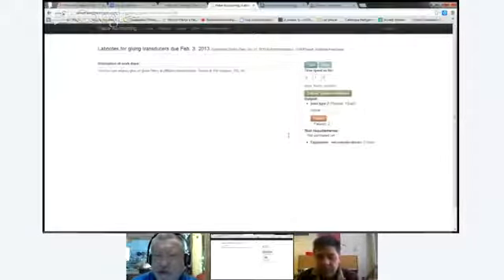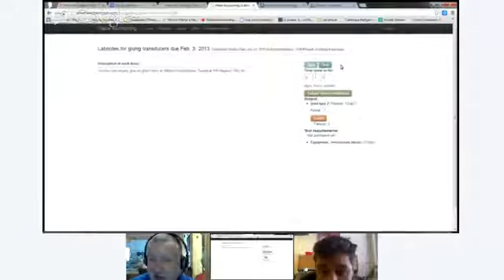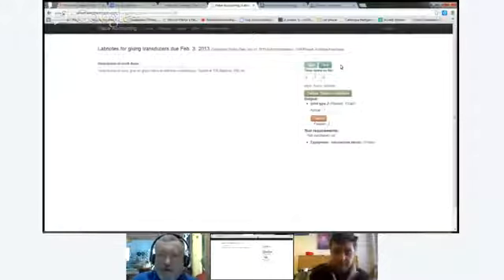Now we're talking about the deliverables, the outputs of this process, the outputs of this work. So now you can associate the outputs with the time contribution. So if you want to evaluate time contributions by their results, not just the time they spent, then now you can do that because this contribution will be associated with those outputs. So you created one that was good and two that were bad. Okay, so now you can evaluate that work then, right?